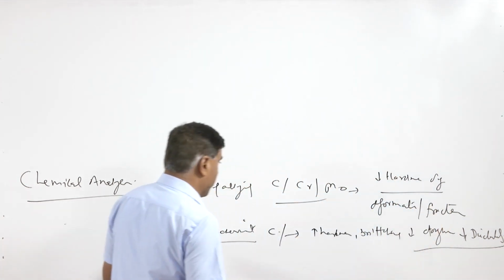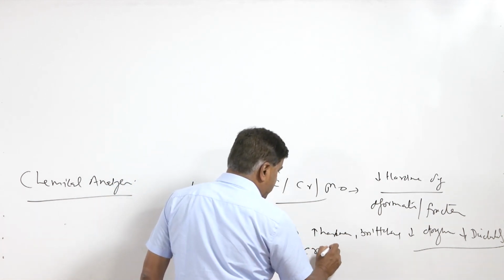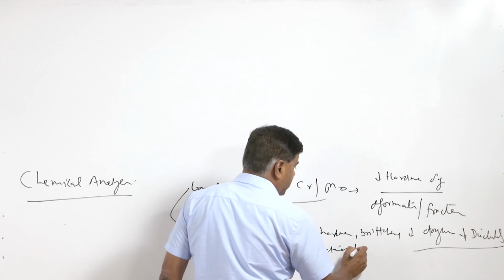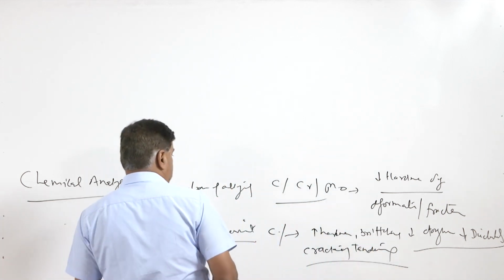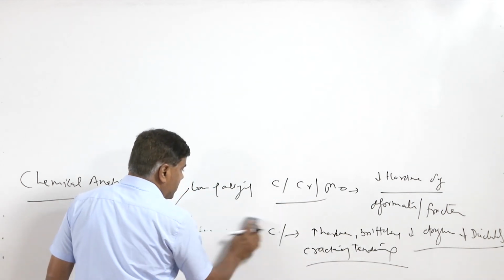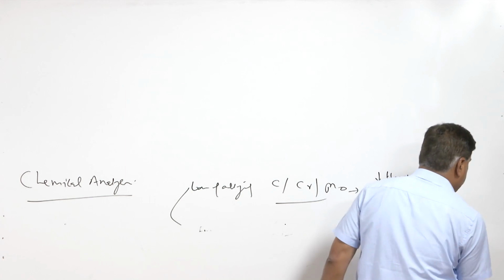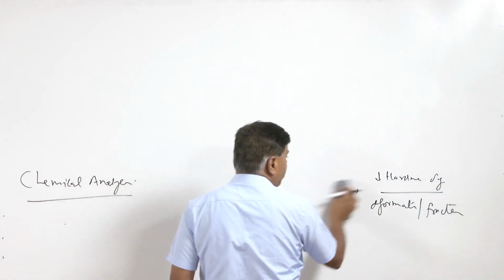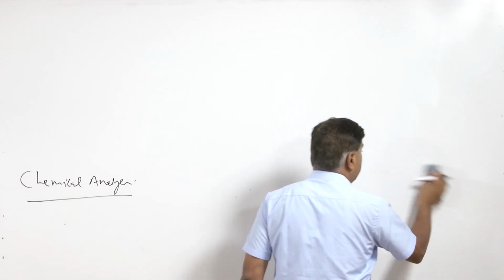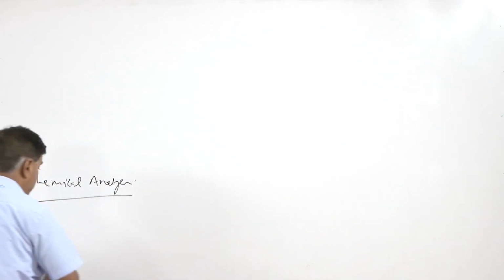So it is possible that under impact load conditions, such components can fail in a very brittle manner. This will increase the cracking sensitivity, or the sensitivity to fracture in the presence of a crack. So it is important to consider this aspect, especially with regard to the macroscopic study of the fracture surface, whether it has been ductile or brittle. Accordingly, it can suggest the possibility of loss of alloying elements.